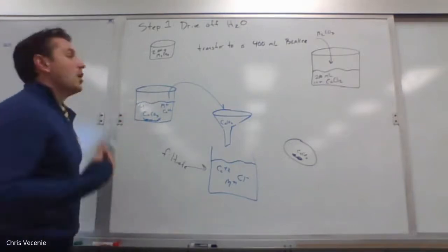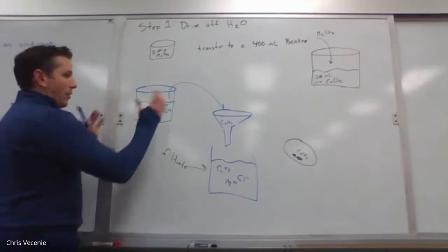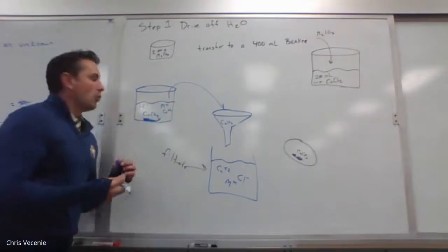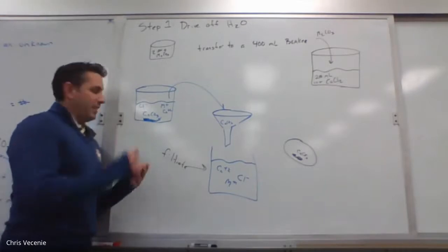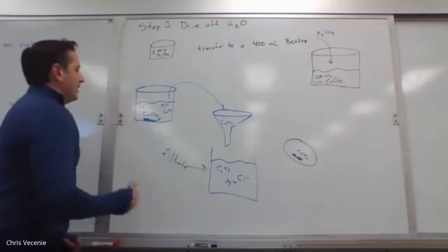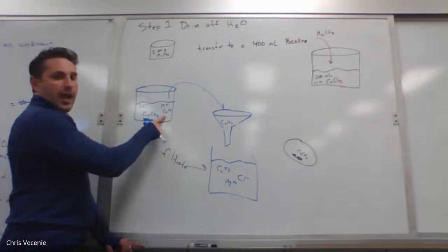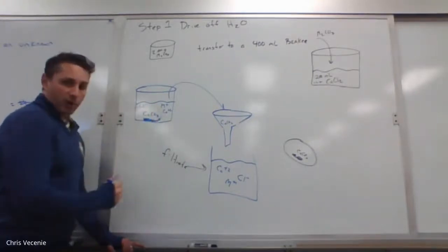When that happens, you are going to see a precipitate based on the equation we just listed. So I'm going to get that same beaker, but I'm going to have some solid spread throughout it. It's going to look milky white, but the milky white is because we're forming a precipitate that hasn't settled to the bottom yet. But there's going to be other stuff in there. Like we said, the calcium carbonate's the precipitate, but you're going to have leftover calcium ions from the excess reactant, and you're going to have the MCl compound break down because it's soluble.